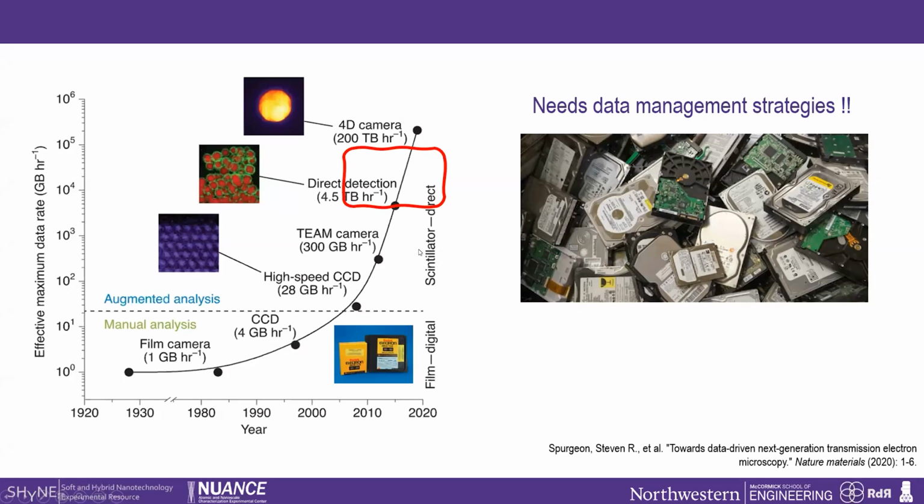And this has become a really big problem, like I mentioned. Most of the users and collaborators that I work with say that's the main bottleneck for analysis and even for usage of these new techniques. What ends up happening is that people fall into the comfort zone of just collecting one diffraction pattern and going back, without utilizing the potential of these new techniques that will unlock different results, a different type of information from the material that you're analyzing, right?